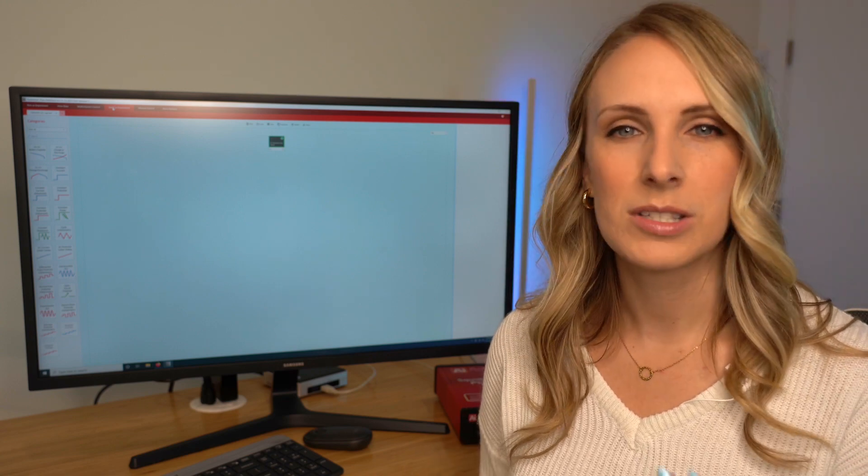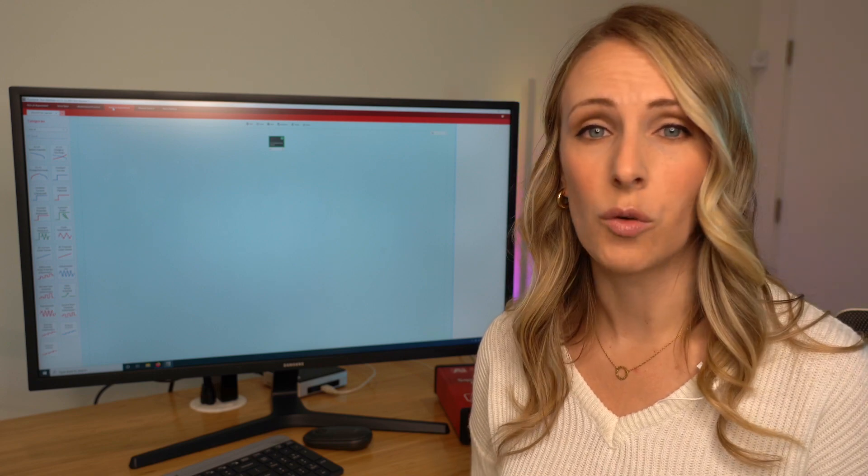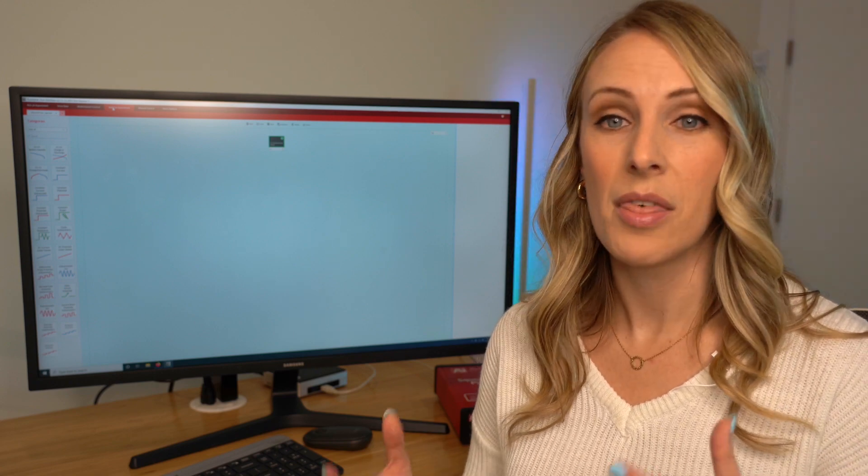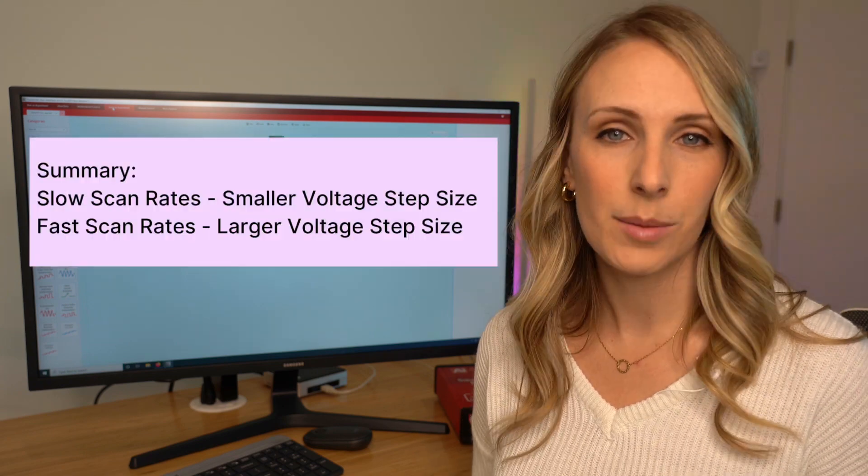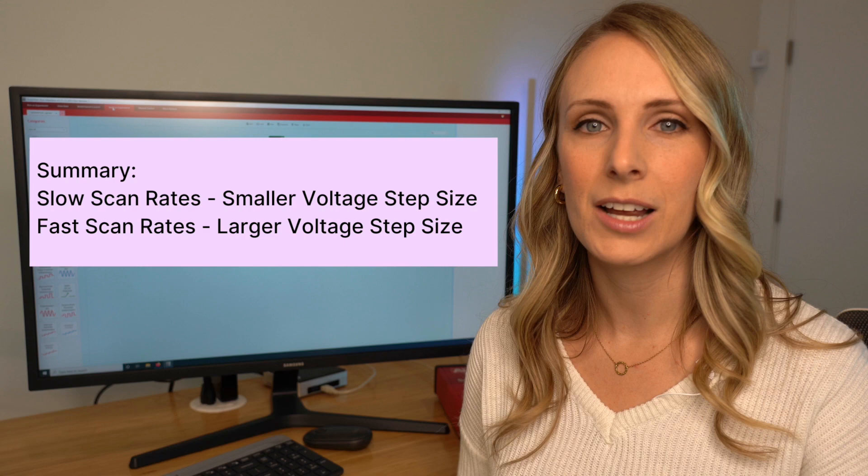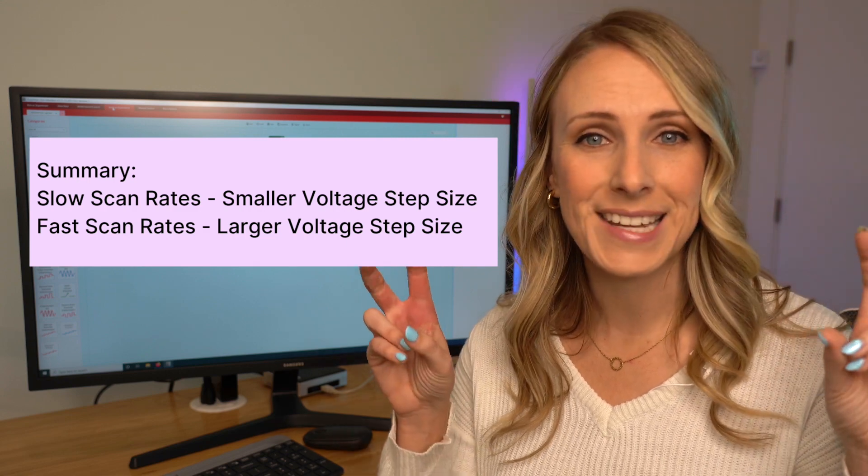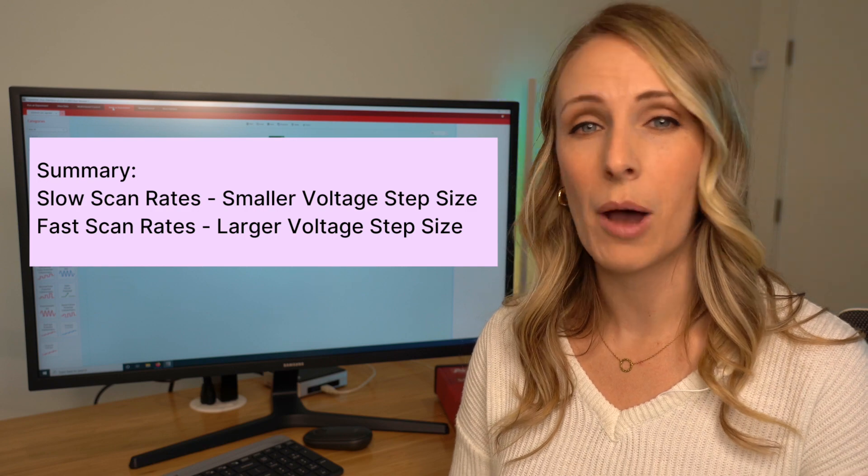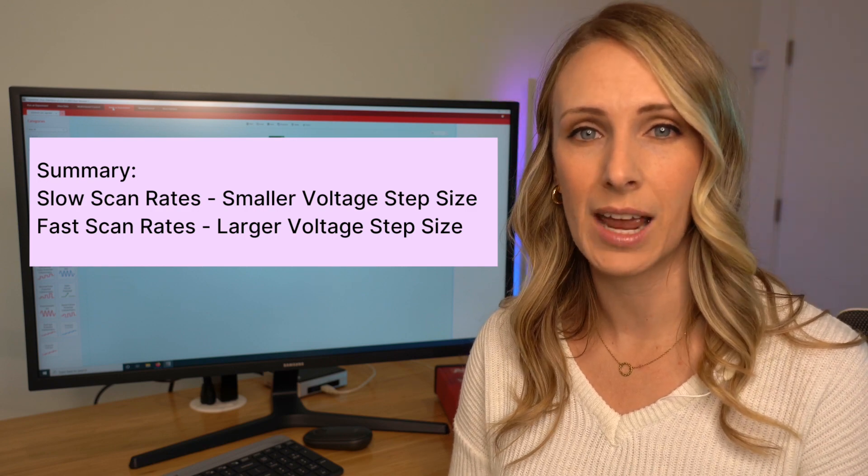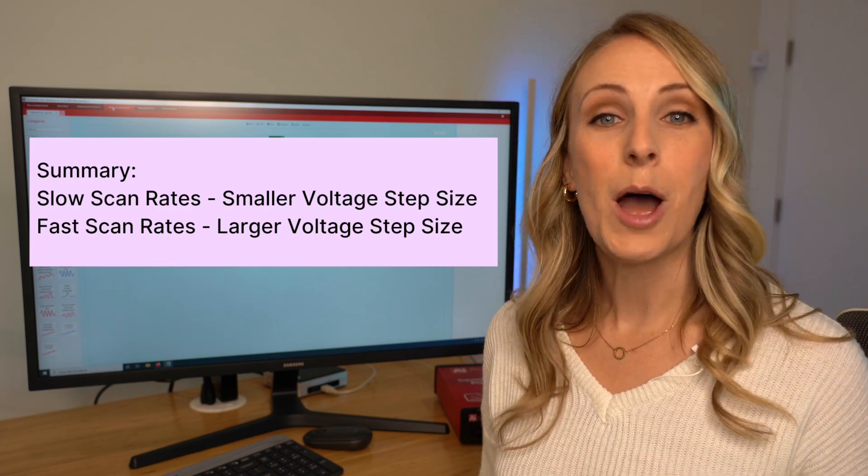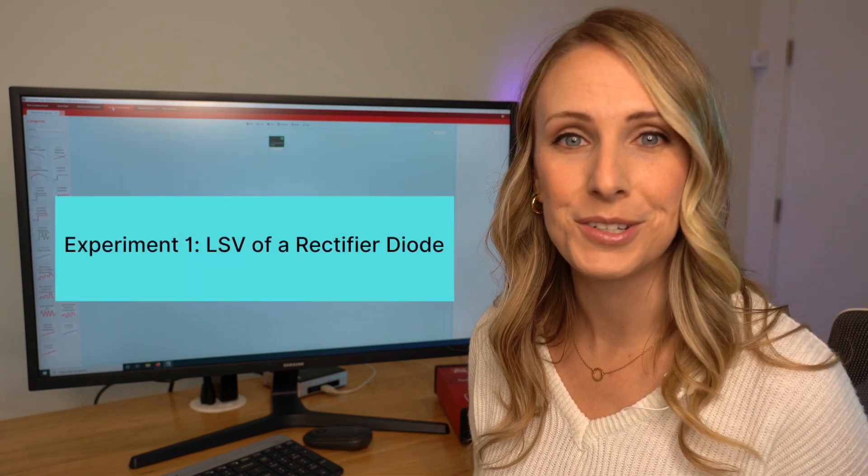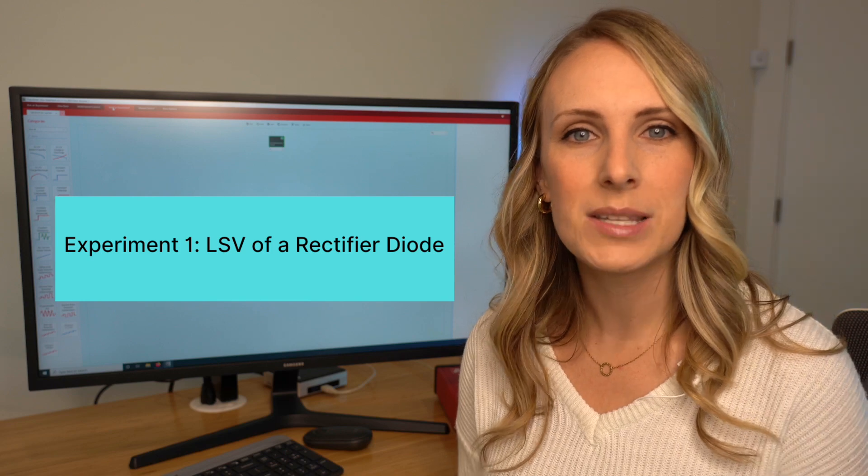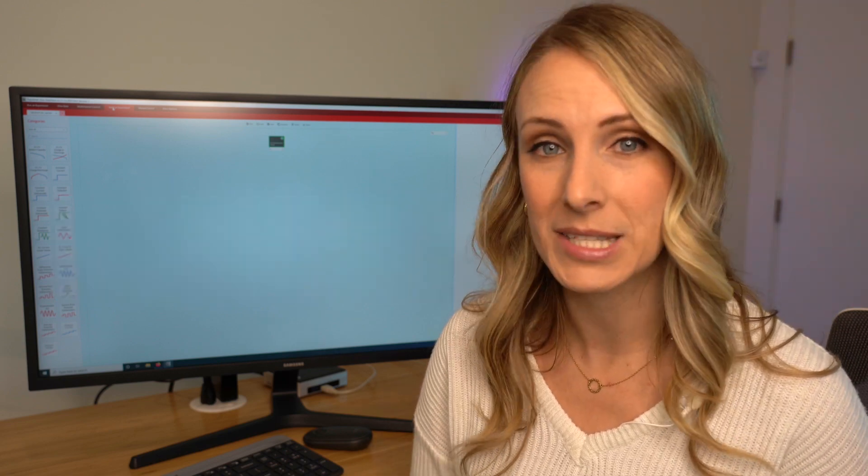If you do a slower rate, perhaps the system's going to change over time and you're not going to get that data you need about that state that you want to see the system in. In summary, in order to avoid the artificially high or low current in your system, that blurry data, you're going to want to be very selective about your scan rate, your voltage scan rate, and your voltage step size. Now I'm going to set up the LSV experiment for that rectifier diode I showed you in order to demonstrate why it's important to select an appropriate scan rate and step size.